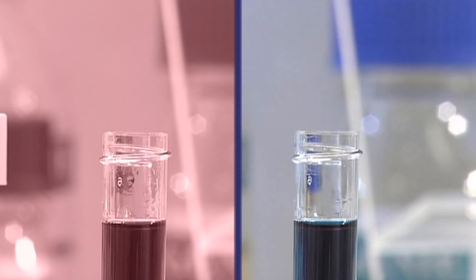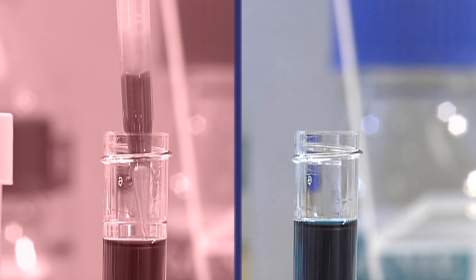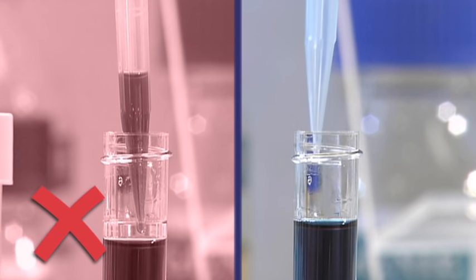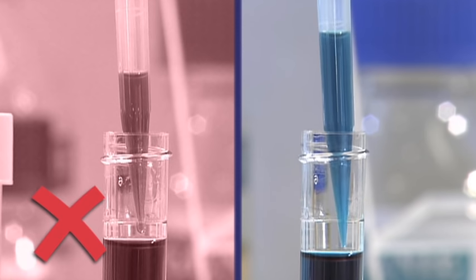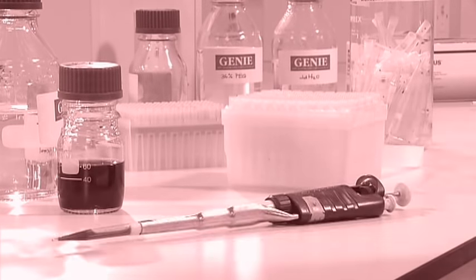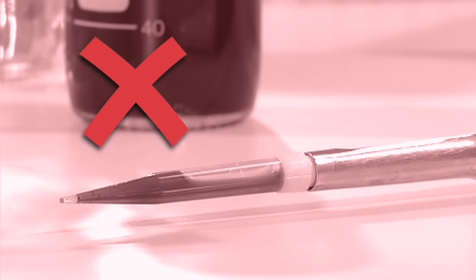When withdrawing a large volume from a narrow container, make sure the tip stays below the surface. Whenever you have liquid in a pipette tip, don't lay the pipette down — liquid can get into the body of the pipette, causing cross-contamination, pipette damage, and inaccurate pipetting. Finally, when pipetting small volumes, touch the pipette tip to the side of the tube to ensure the liquid is released into the recipient container.